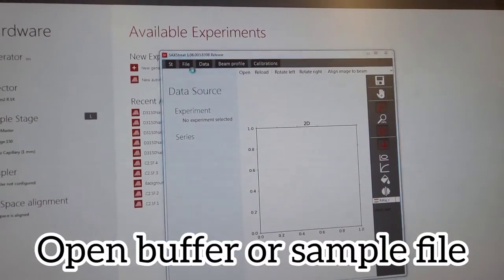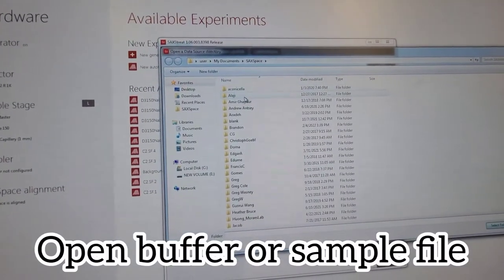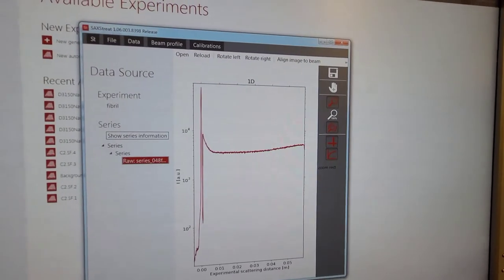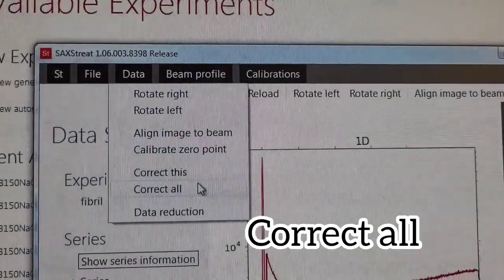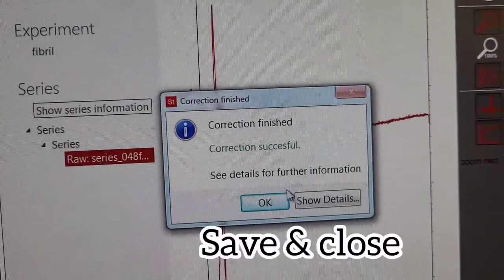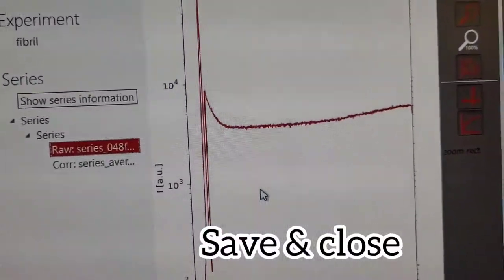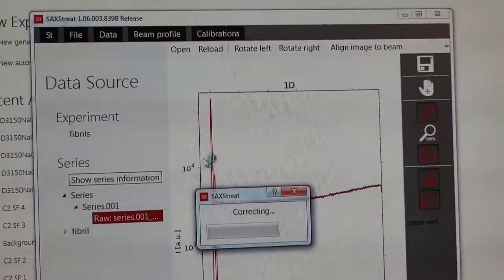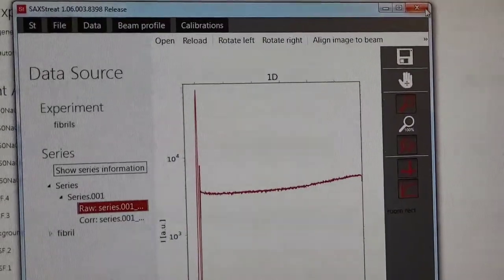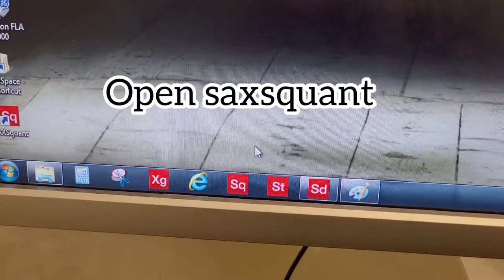After you run both buffer and sample you want to go to the SAXStreat software. You go there, do it for both. You do a correct all and save. That's simple. You just do this for the buffer and sample. You have a file created. I think it's a PDH file for both.